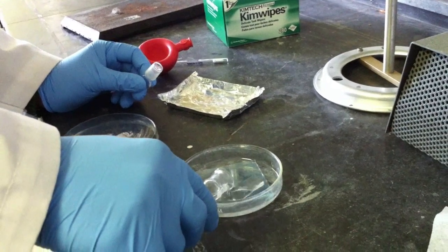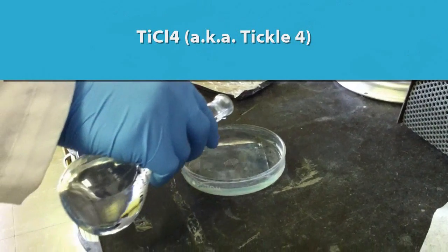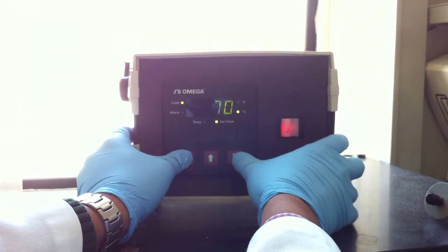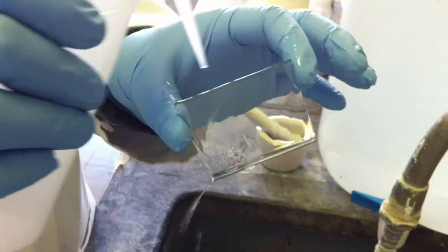To deposit this layer, we use an aqueous solution of titanium tetrachloride poured over the surface of the electrode and then treat at 70 degrees Celsius to form titanium dioxide. After heating, the electrode is rinsed with deionized water and ethanol.